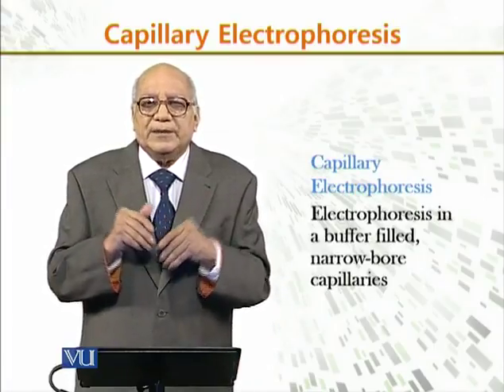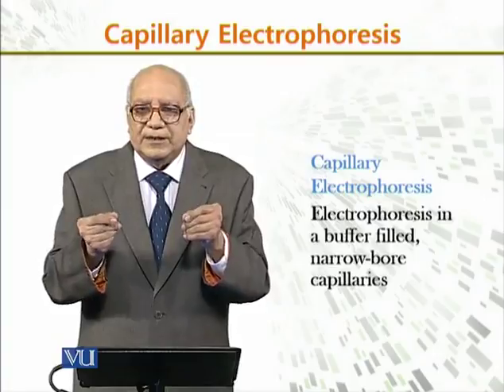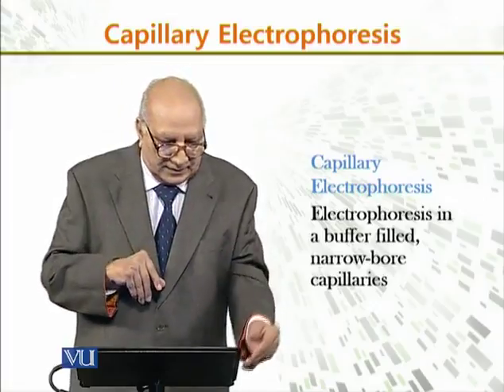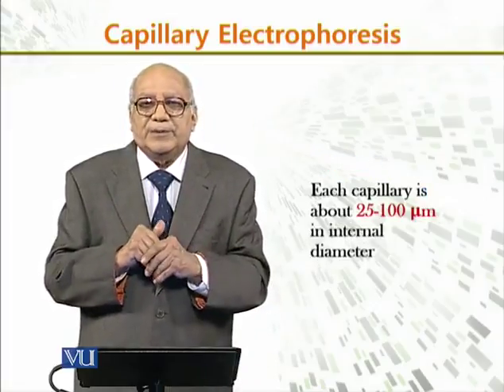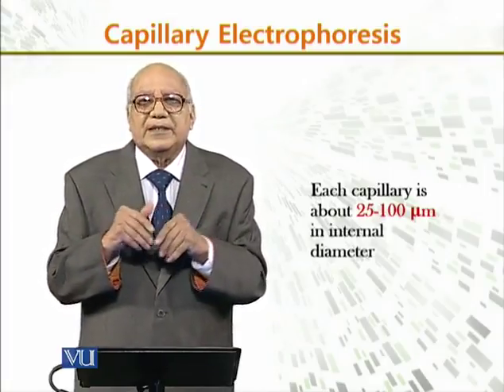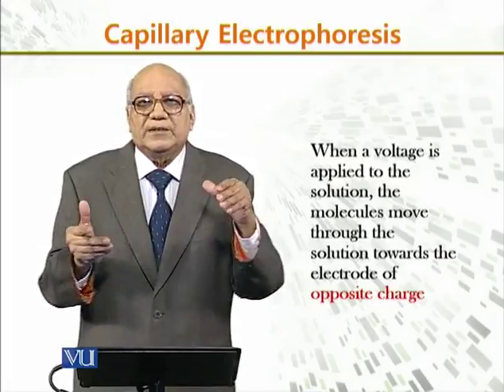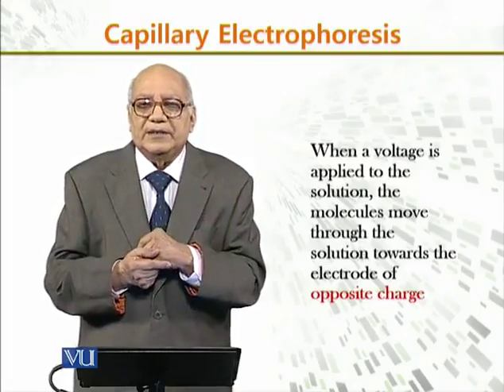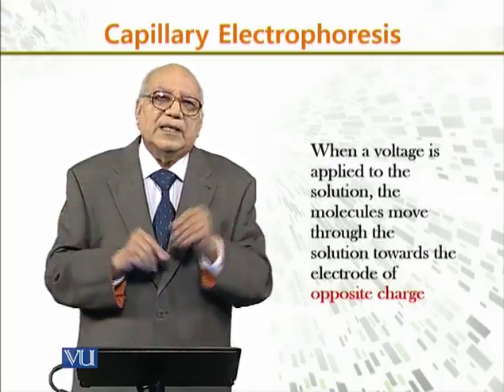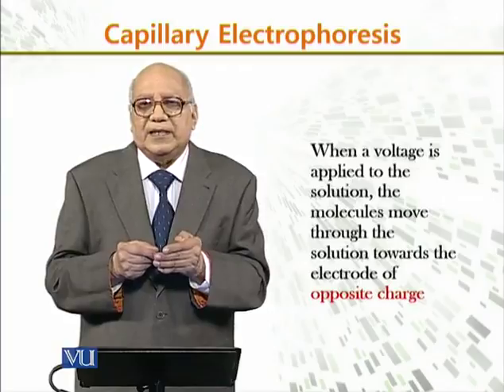Now, in capillary electrophoresis, the capillaries are filled with a buffer. In narrow-bore capillaries, they are filled with buffer rather than the gel. Each capillary is about 25 to 100 micrometers in internal diameter, as indicated previously. When a voltage is applied to the solution, the molecules move through the solution toward the electrode of opposite charge, as is the principle of electrophoresis.